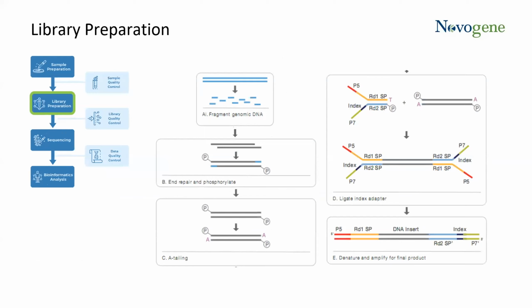On the picture, you have an example of three different samples' QC and also the gel electrophoresis results. So once we receive the confirmation from you that we can move forward, your samples will go through library preparation.